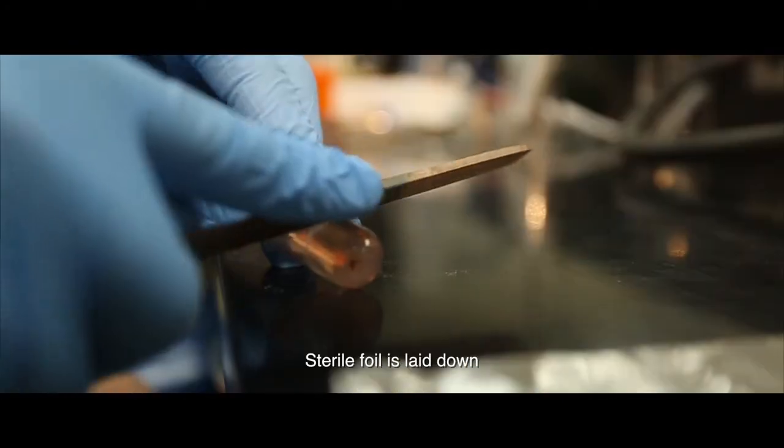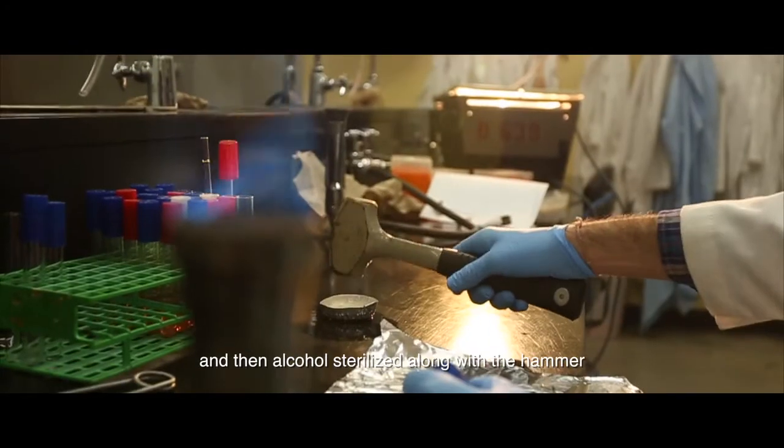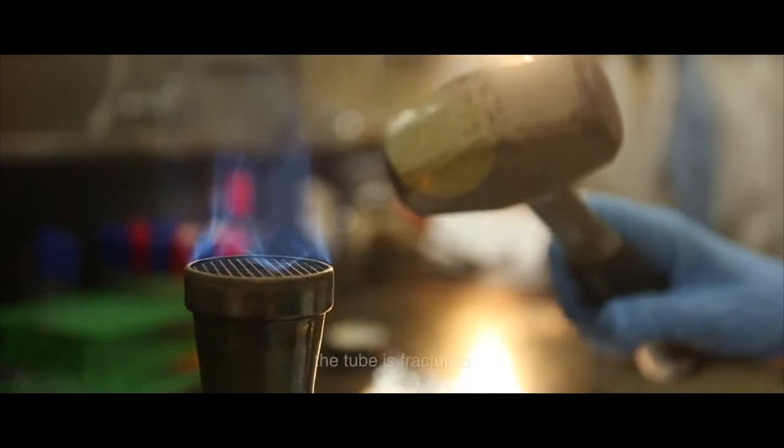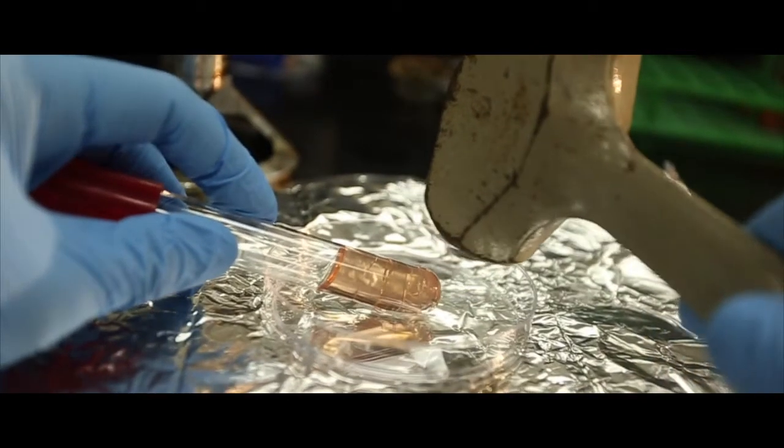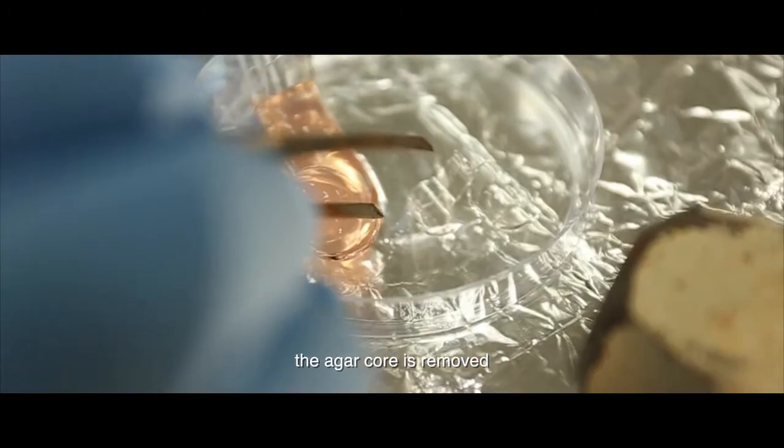Sterile foil is laid down, the oxygen gradient tube is scratched, and then alcohol sterilized along with the hammer. The tube is fractured. The auger core is removed.